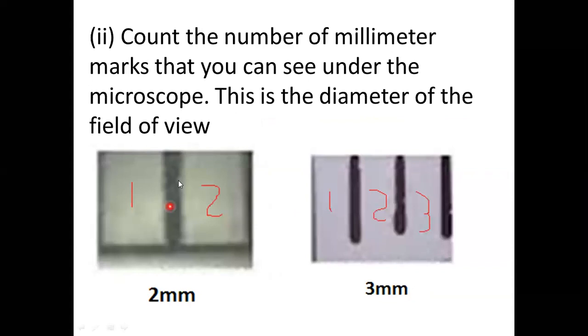You see something like this, this is now the millimeter mark. Remember that the millimeter mark is magnified, let's say 40 times. It's like that ruler of yours now enlarged 40 times. So whatever you see may be something, you will see those lines. Make sure you focus until you see those millimeter marks.